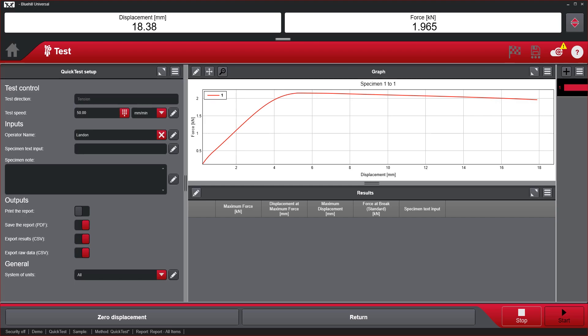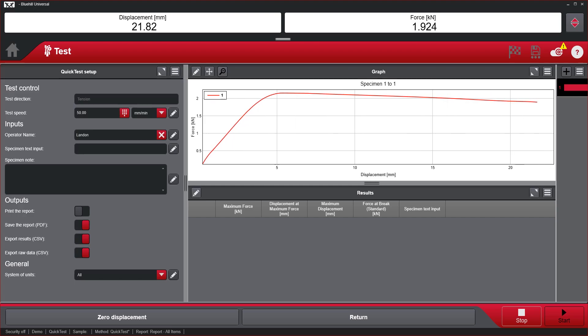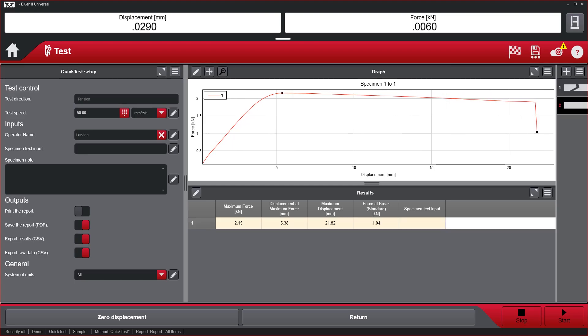QuickTest is also for R&D and quality professionals who need access to simple material or component properties such as max force or force at break.